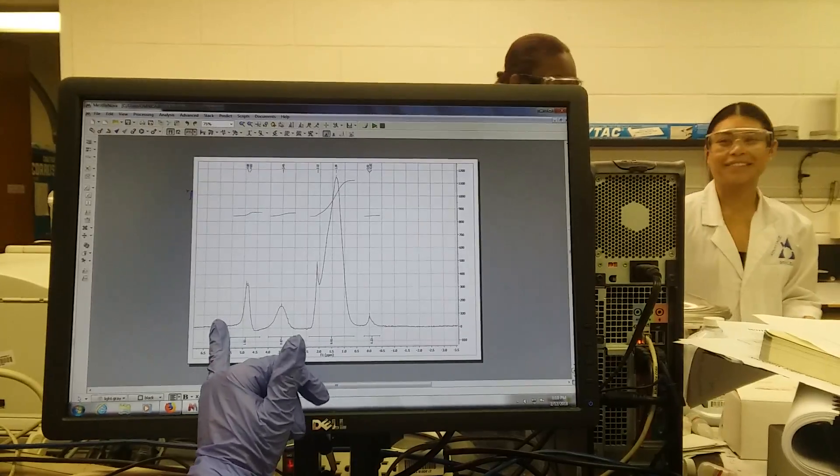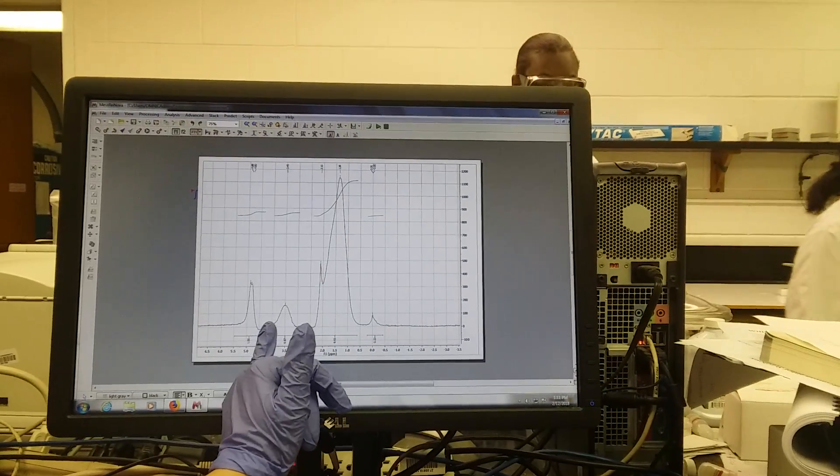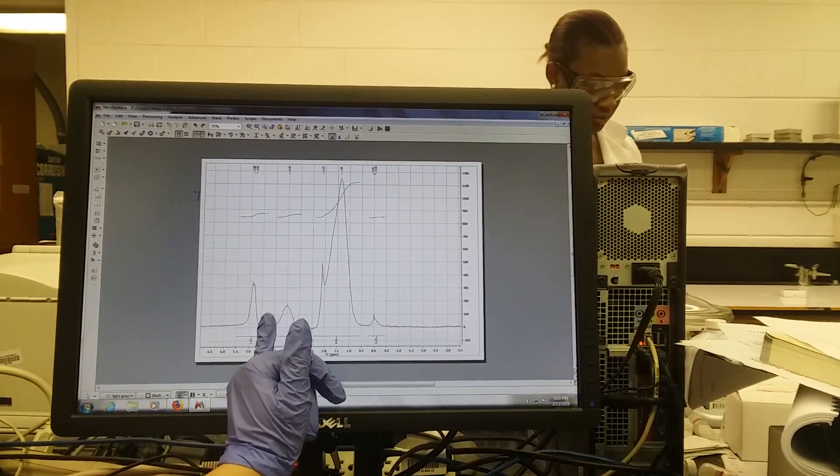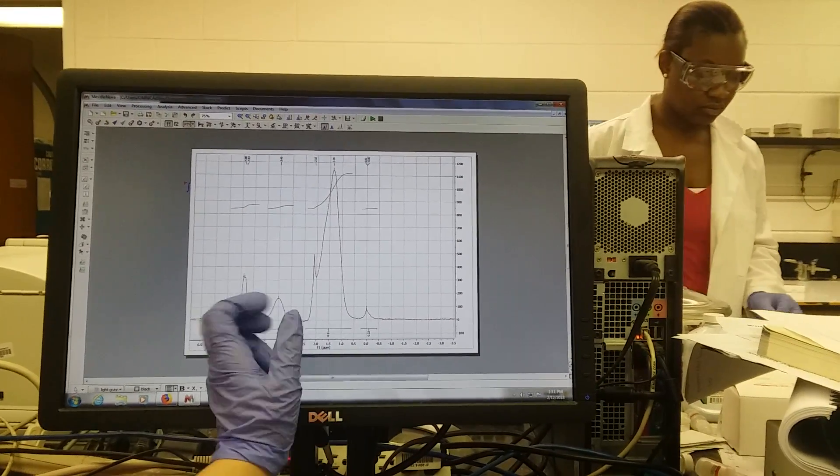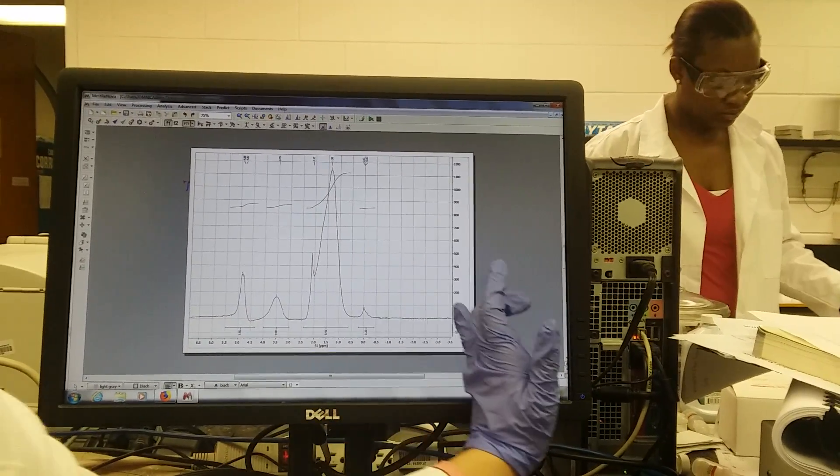You're going to go to integration, and you're going to drag across each group of peaks independently.